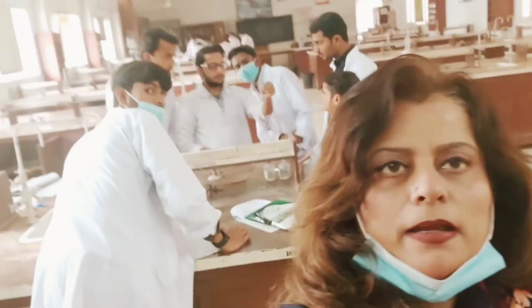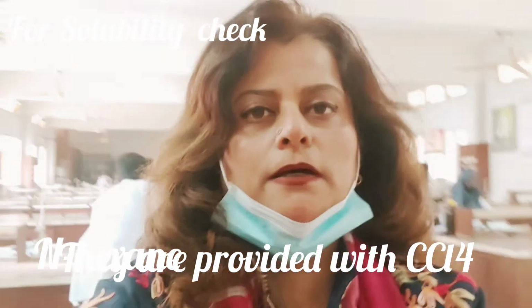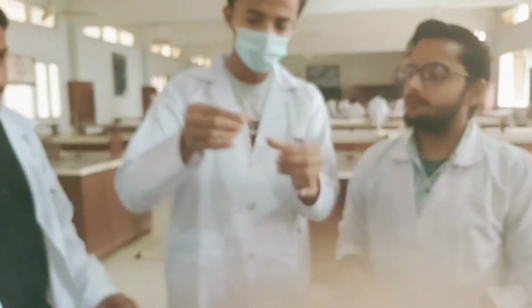My students are performing the solubility test behind me. I can show you they are doing the solubility test in different solvents. I have provided them carbon tetrachloride, n-hexane, chloroform, benzene, and a number of other solvents so that they can check the solubility of the compound. This is how they are doing it.